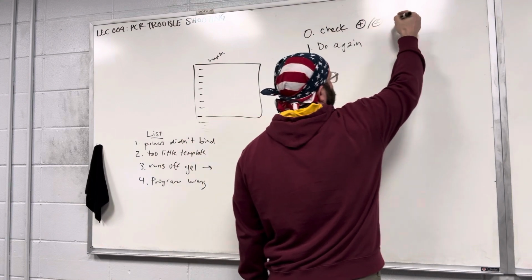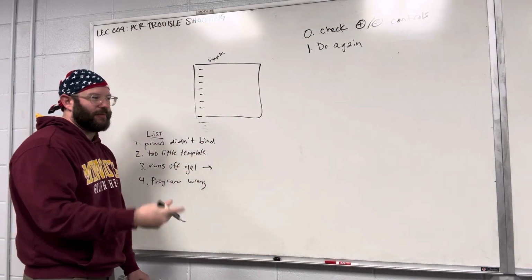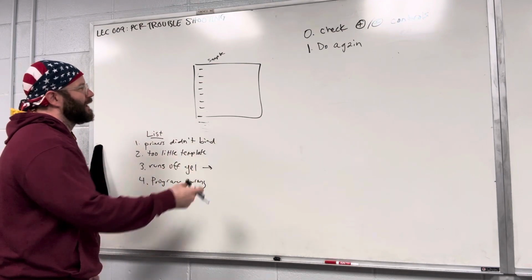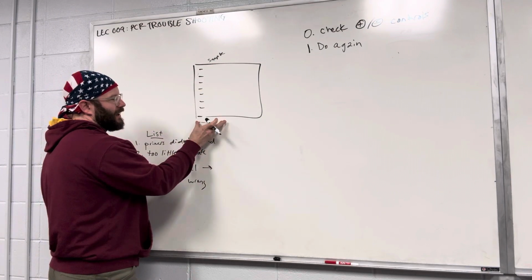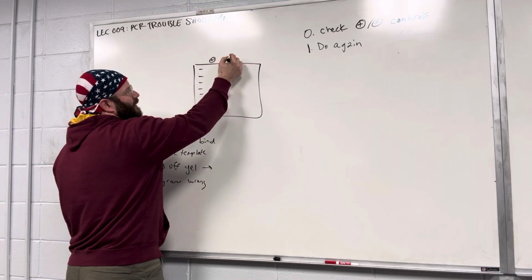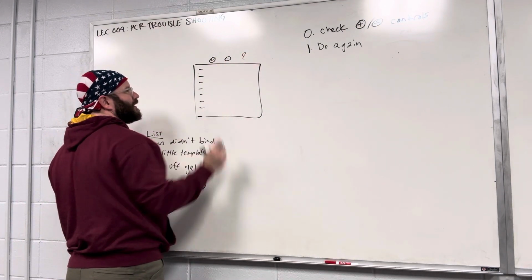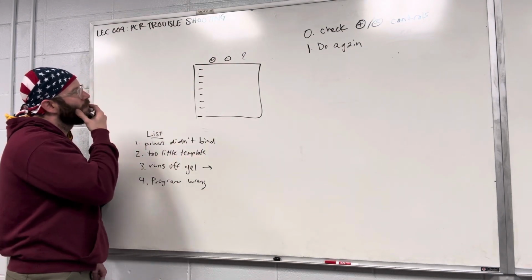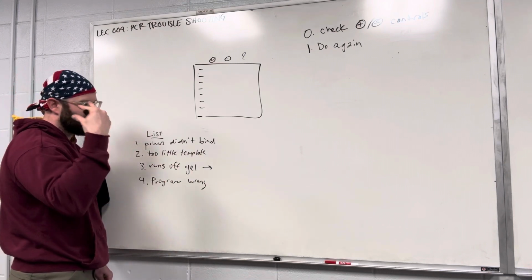We should check positive and negative controls. Every time you run a PCR, or any experiment at all in science, there should always be a positive and a negative control. The fact that I drew this with a ladder and just a sample is bad experimental design. You should always have a positive control and a negative control before you test the sample that you're running. So why do you have a positive and a negative control? What will they tell you?